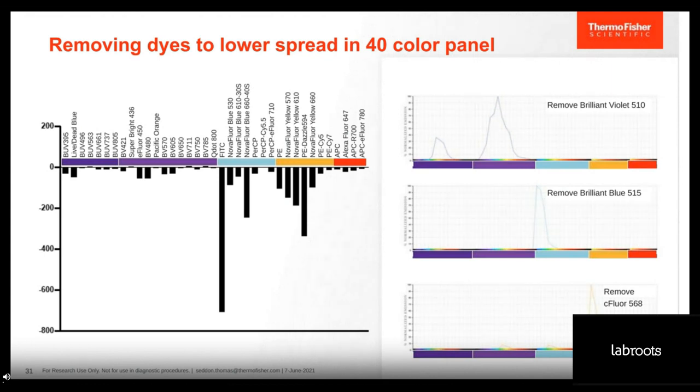And what this really is saying is, what is the sort of background that starts to creep up that affects what you can actually detect there. And so, when that's decreasing the change in the spectral spread, that means that you should be able to gain more resolution in that process.